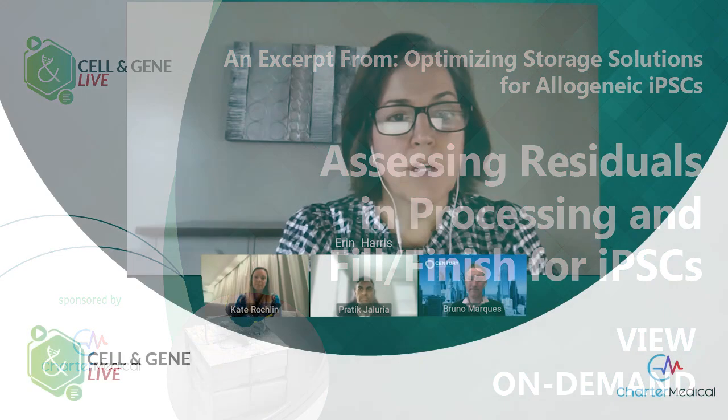I want to make sure we're getting to fill finish, certainly, before a couple more topics before we officially turn over to our audience Q&A. Specifically with regard to fill finish, I want to hear perhaps from each of you the analytical methods that you're employing to detect and quantify trace levels of cryoprotectants and perhaps other excipients in the final cell therapy product. I would offer it up to all three of you, but perhaps Pratik, can you start us off?